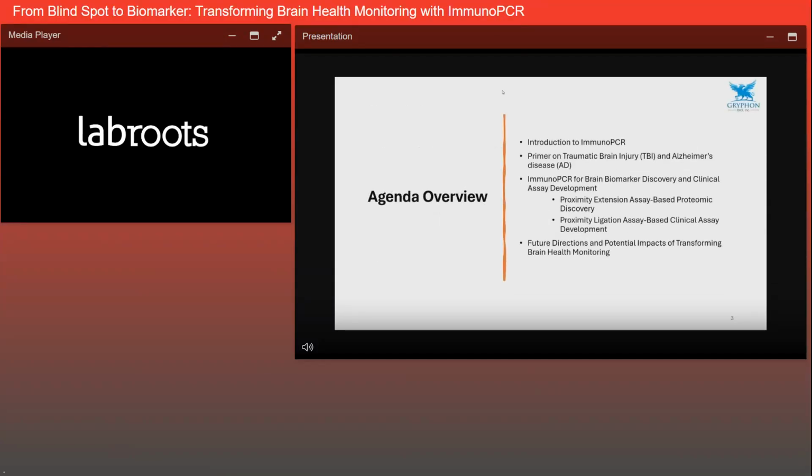So you just heard a nice introduction to some of the technologies from Thermo from Aleksandra. I'll provide, again, a very brief introduction to ImmunoPCR in general, as well as traumatic brain injury and Alzheimer's disease, which is the focus of Gryphon Bio. Then I'll follow that with a discussion about how we're using ImmunoPCR in two different ways for brain biomarker discovery and clinical assay development. In particular, the proximity extension assays, or PEA-based proteomics assays for biomarker discovery, and the proximity ligation, or PLA assays for clinical assay development. And then I'll wrap up with some thoughts on future directions and potential impacts on how we can transform brain health monitoring.